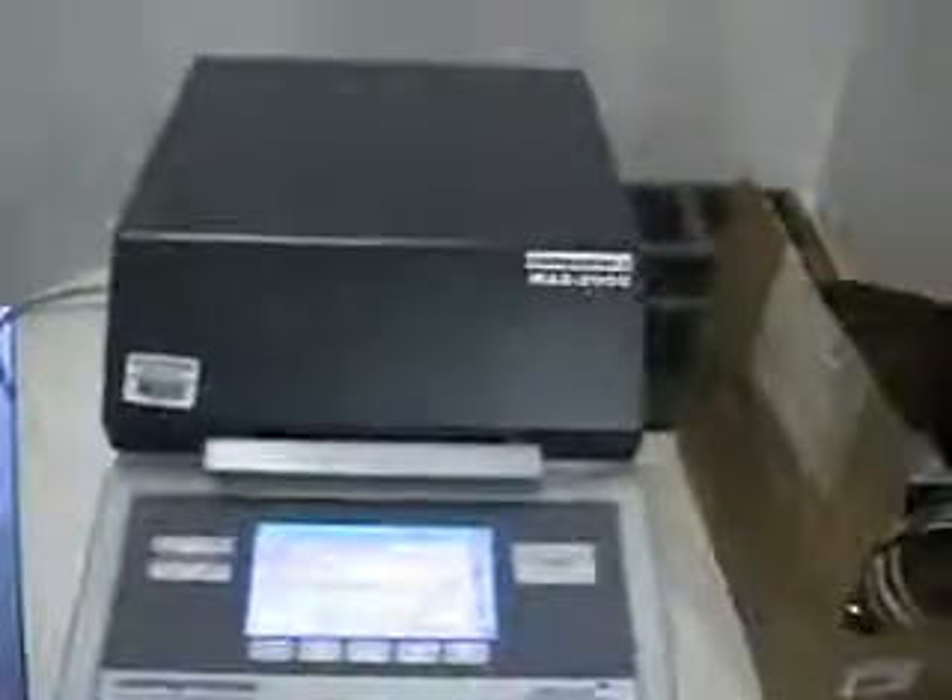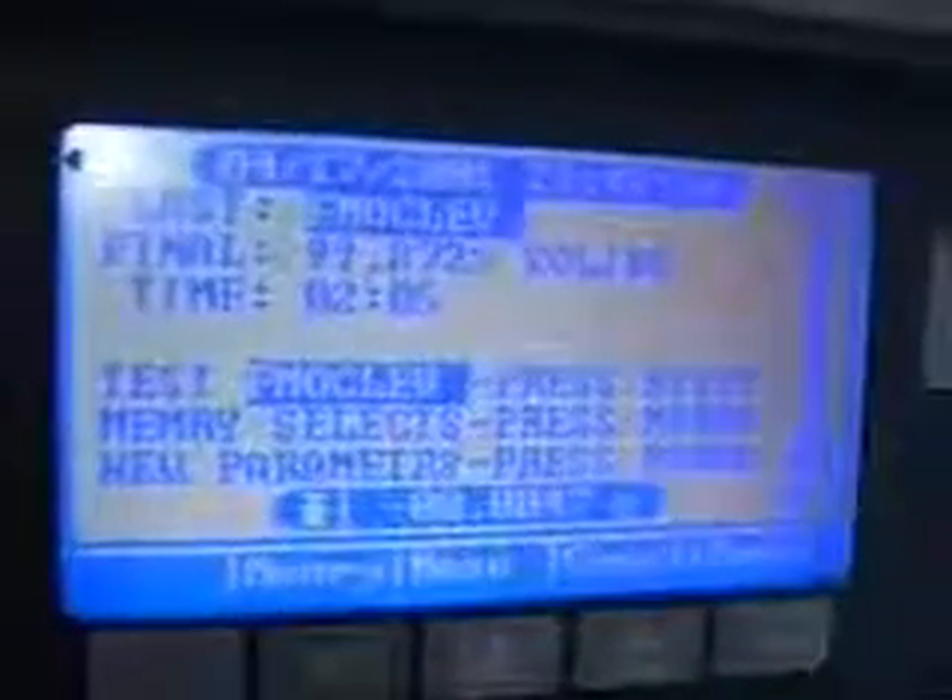This is the Arizona Instrument CompuTrack Max 2000 Moisture Analyzer. You can see the display of the unit working. Right now there's no weight on it. The unit's in excellent condition.